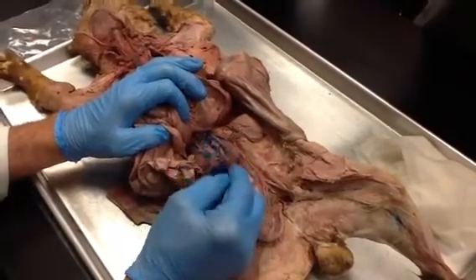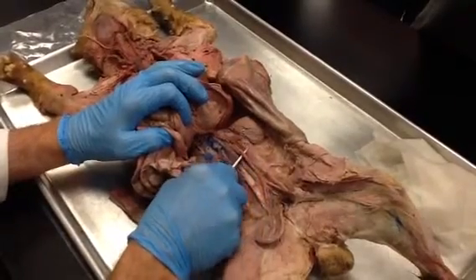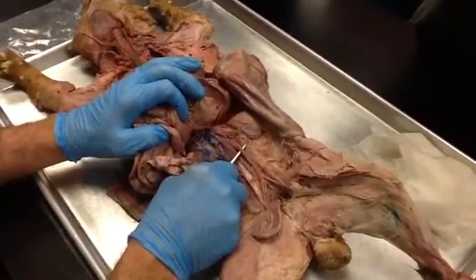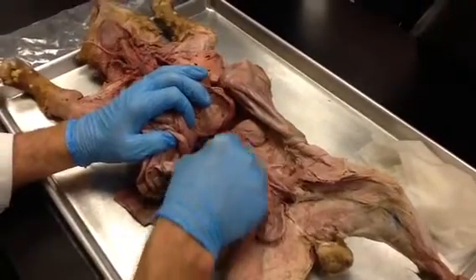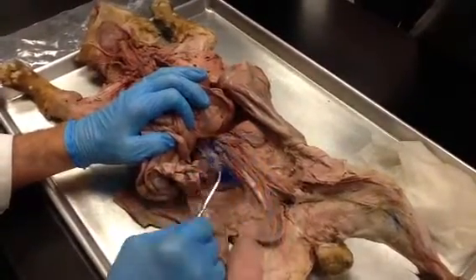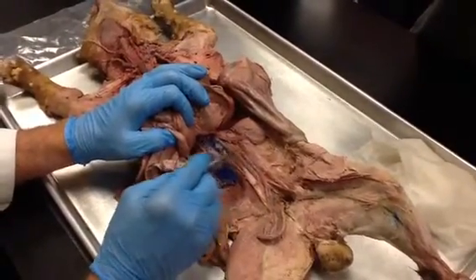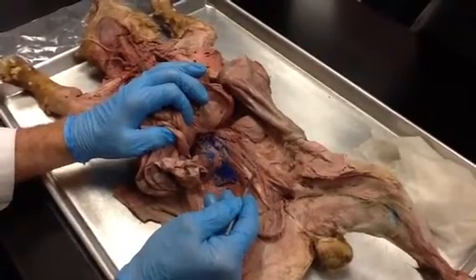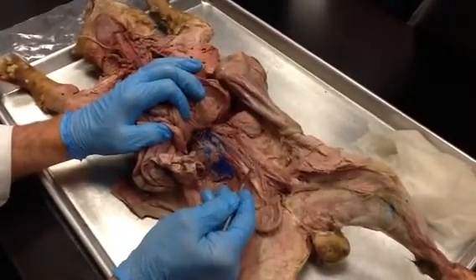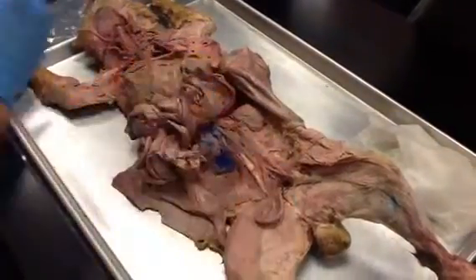The renal artery attaches to the abdominal aorta just as it did in the torso model. So it'd be the same to the right as well as to the left side. This little vessel you see right here that's been sectioned is all that remains of my inferior mesenteric. I had to remove that so I could fold everything out of the way.